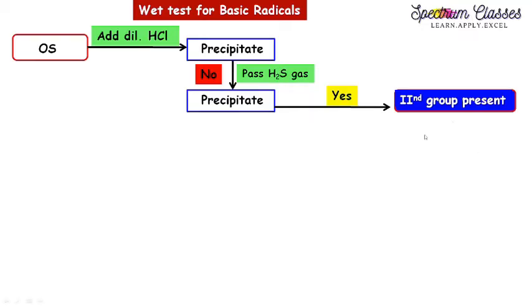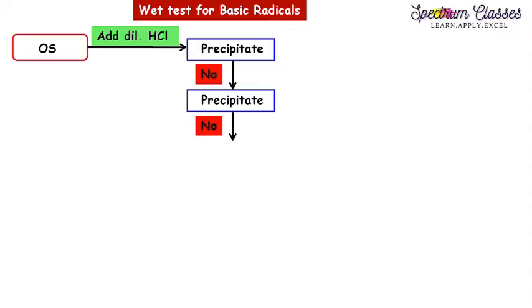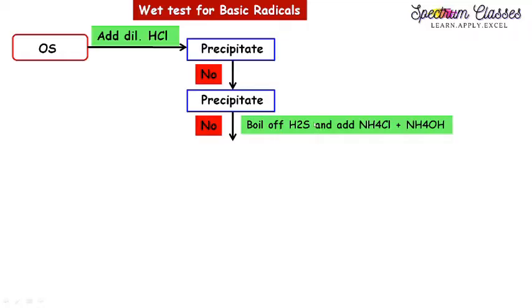If no ppt is observed, group 2 is absent and we move to group 3. To check for group 3, we first have to boil off the H₂S gas. To check whether all the H₂S gas is boiled off, use lead acetate dipped filter paper. After boiling off the H₂S gas completely, add ammonium chloride first and then ammonium hydroxide solution. This is how the group 3 group reagents are added.